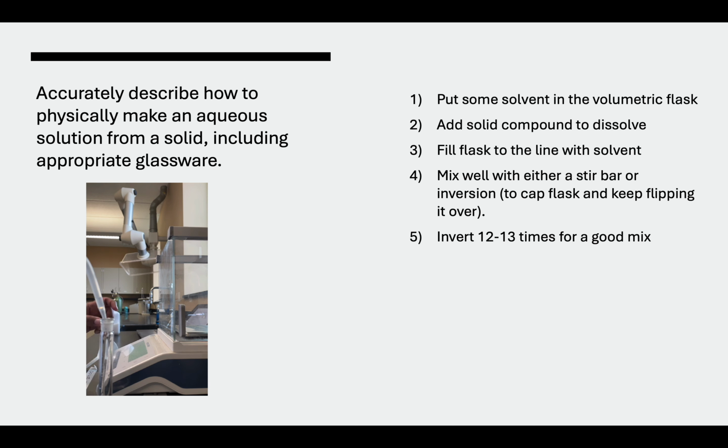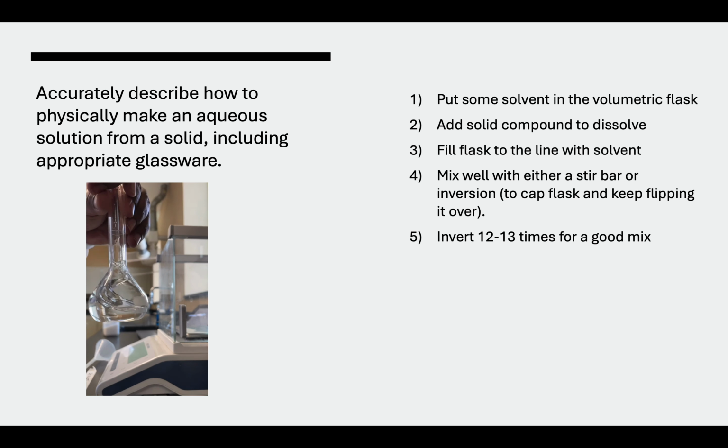And a lot of times there's also sugar stuck to the sides of the flask, so you want to rinse that out as well. After that, you just want to swirl it to get the dissolving started.